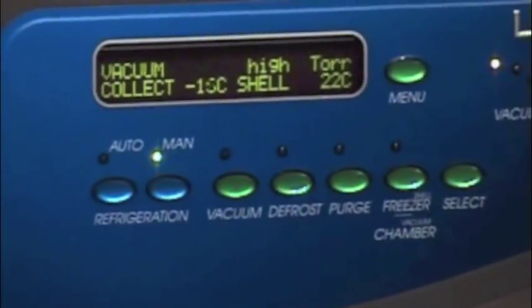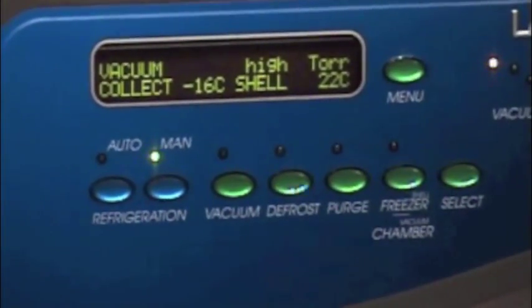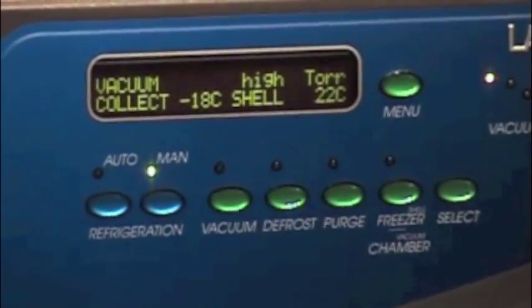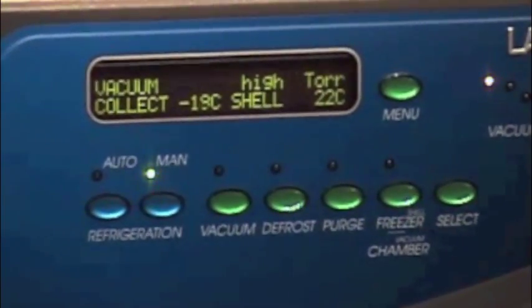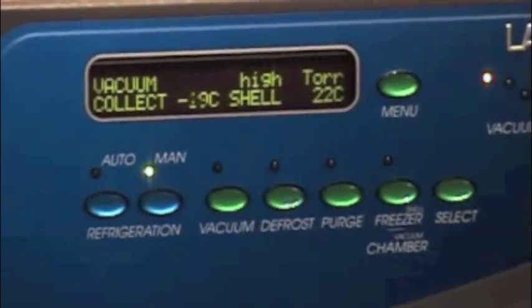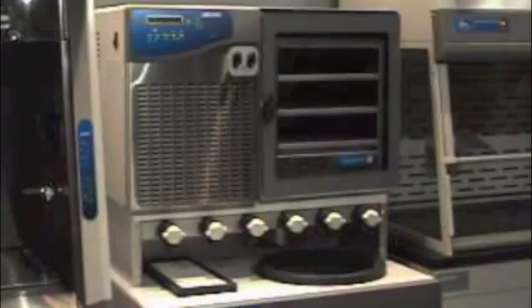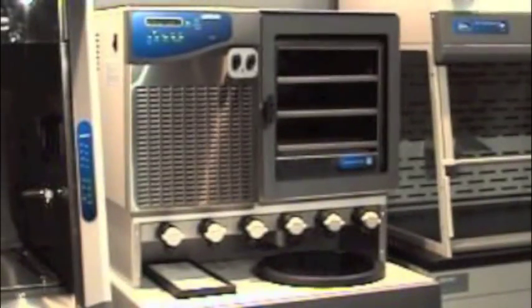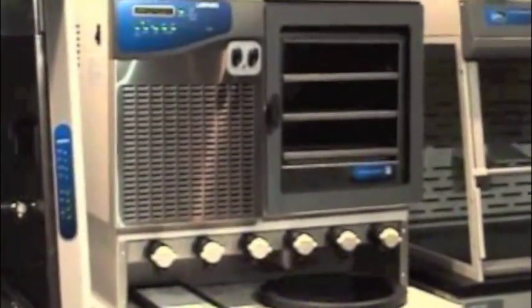Turn the refrigeration on in manual mode. In manual mode, you will manually set temperatures for pre-freezing, primary drying, and secondary drying.